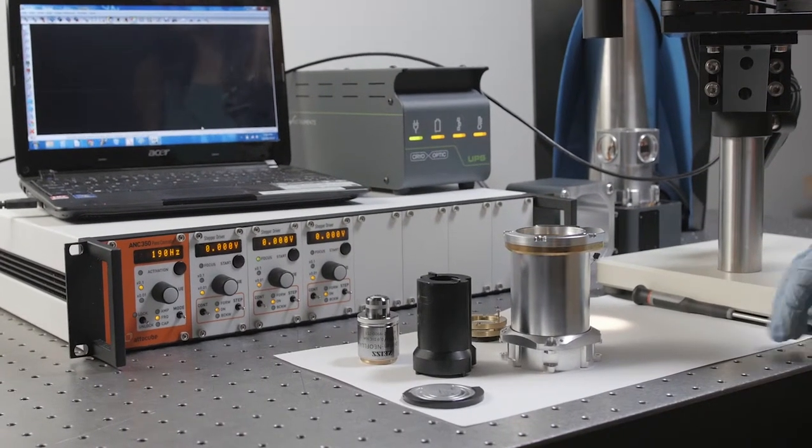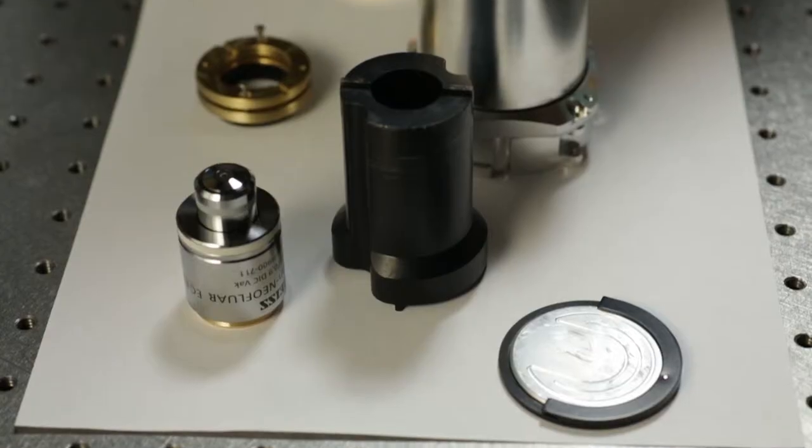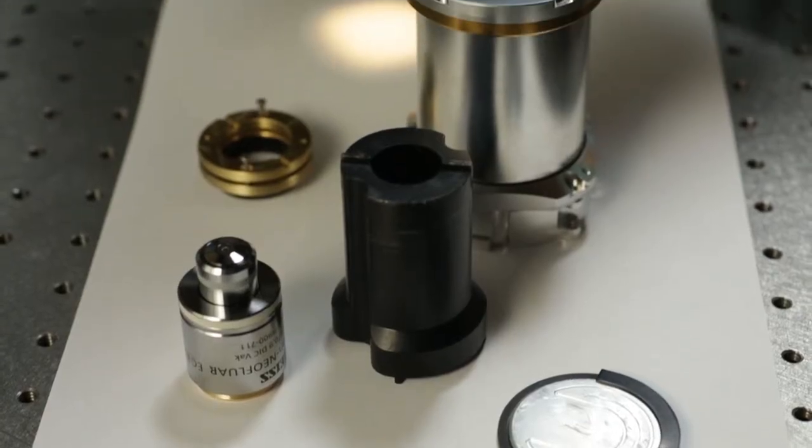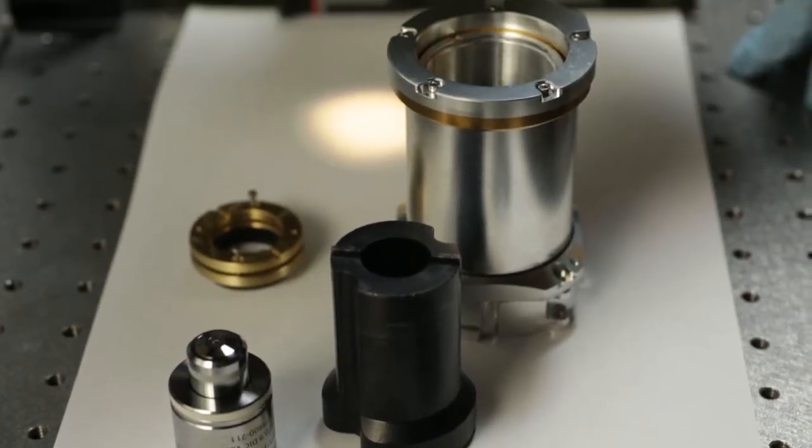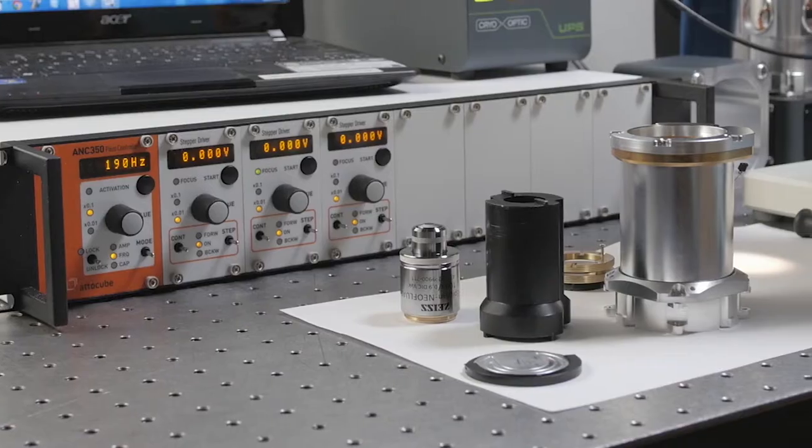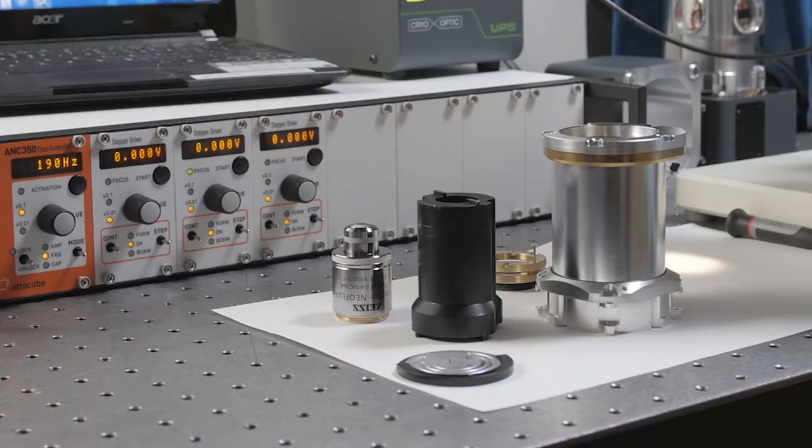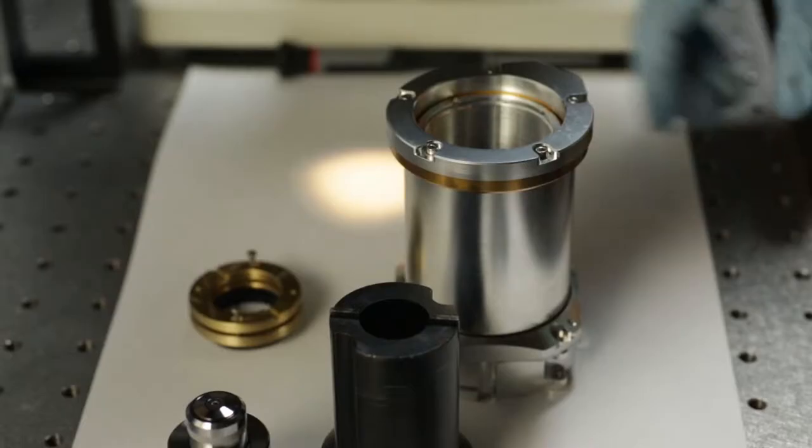The objective comes pre-aligned in the cryo-optic holder, but if you want to install your own objective or take the objective out for any reason, you can follow this procedure to align the objective.